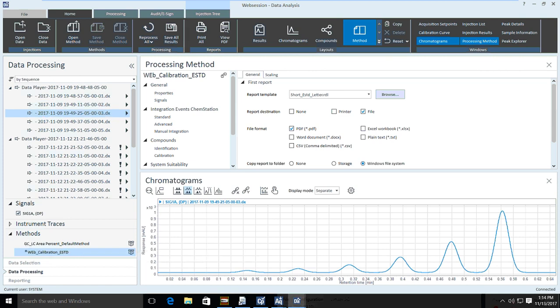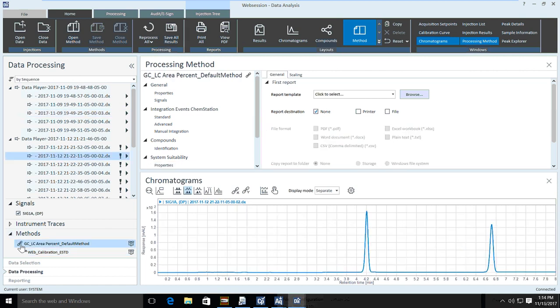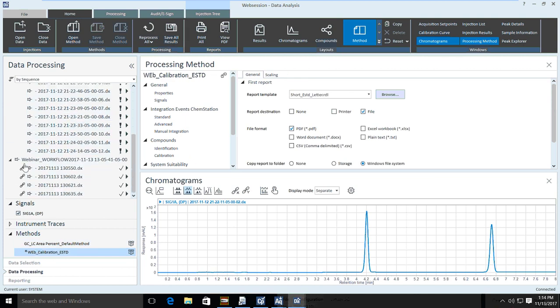So that's the other tool here: depending on whether I'm clicking on a data file or a method, my chain is going to appear one way or the other, right? If I'm clicking here, my chain appears on the method, not on the data file. But if I click on this method, it appears down on the data files and not on the method. So that's one way to use that.